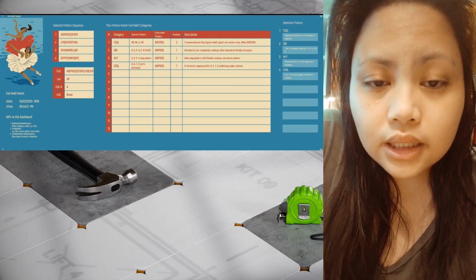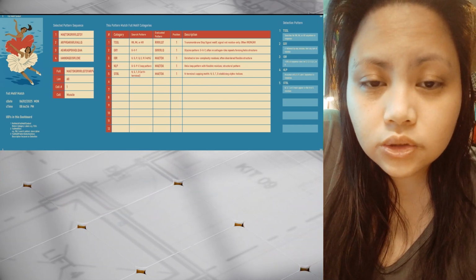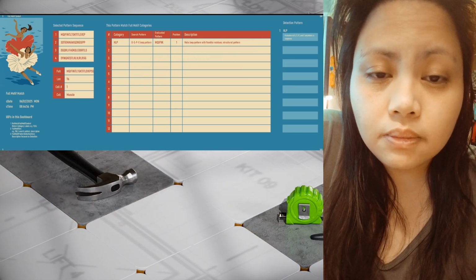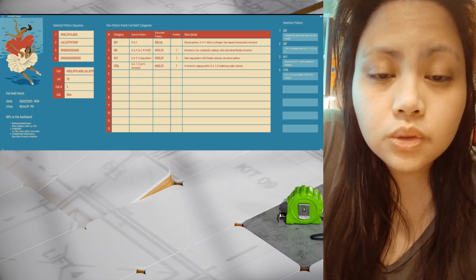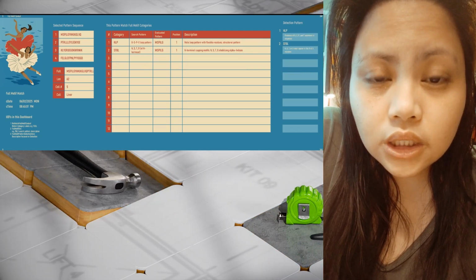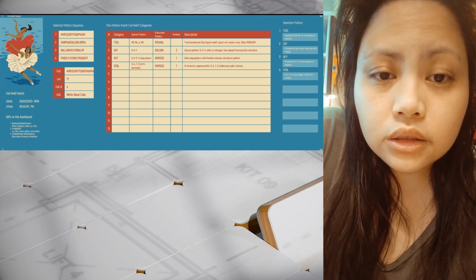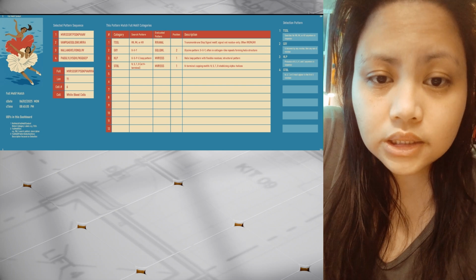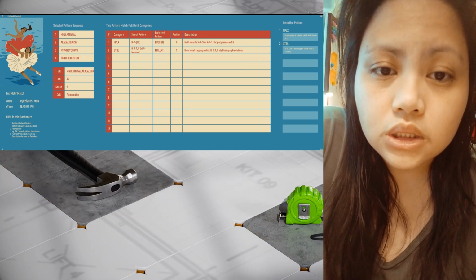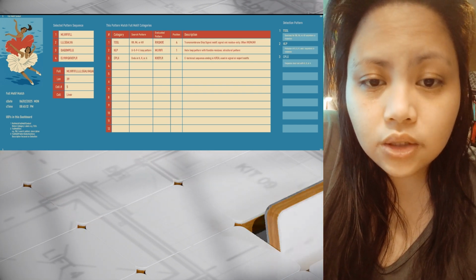Others are like in the N terminal, this should be in the N terminal, and then there's also an ending. So this is in the N terminal and there's an ending, something like that. So it does not rely on single presence. The 2 dashboards that were there already before this update are focused on single presence amino acids. This one is the full motif context. So those are the 3 additional dashboards that I created today.